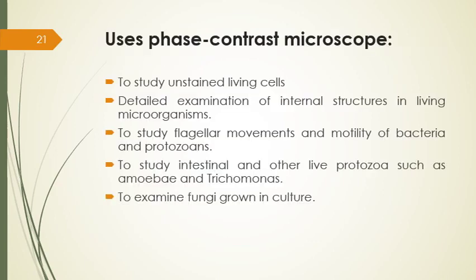So here in the end, we have the applications or uses of phase contrast microscopy. Simply, we study the unstained living cell. Detailed examination of internal structure in living microorganisms in their natural state.